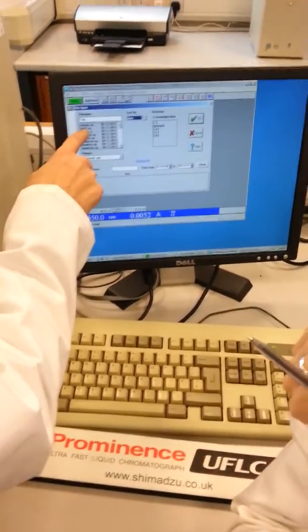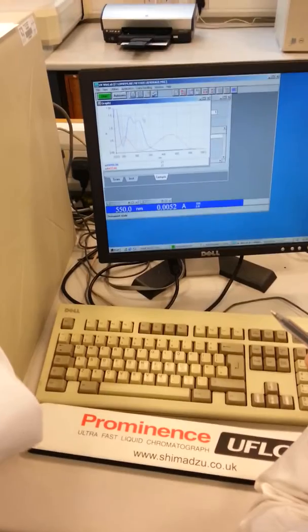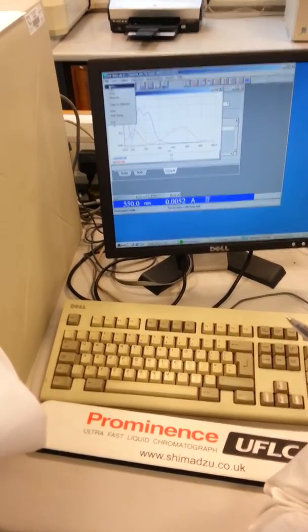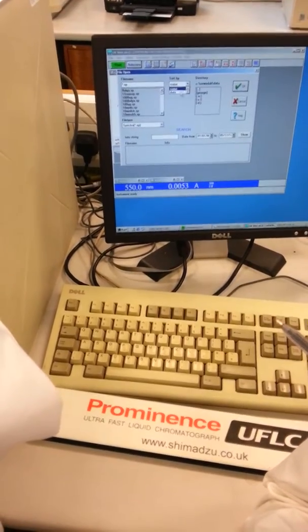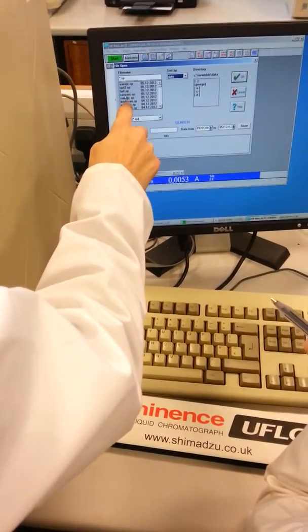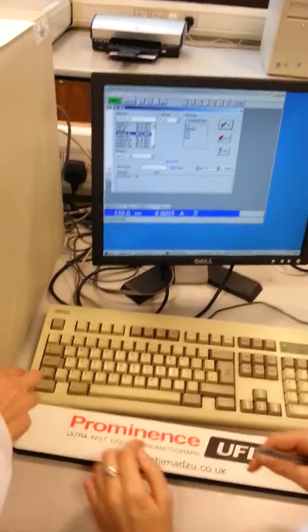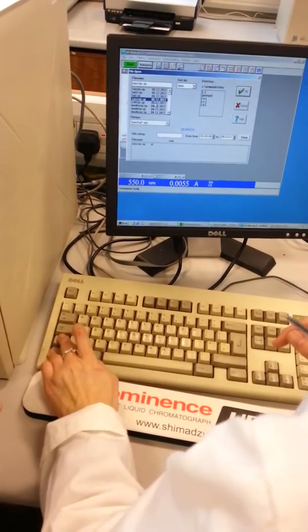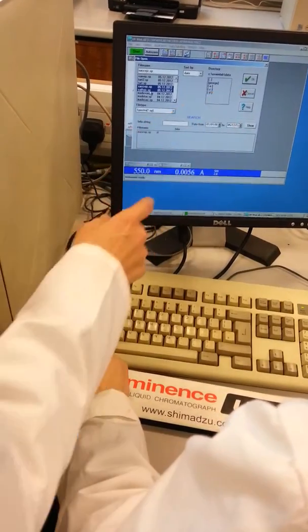Tartrazine, the first one. Click on that and OK. In File, Open. Right, date. Saccharin. Are those two OK? Yeah, they're fine. So if you click on Saccharin, then press Control-Shift at the same time. Click on Caffeine and OK.